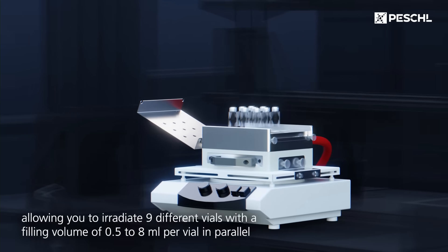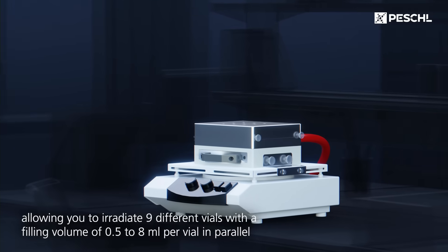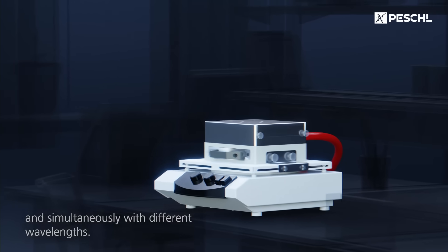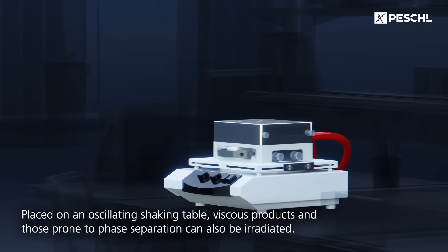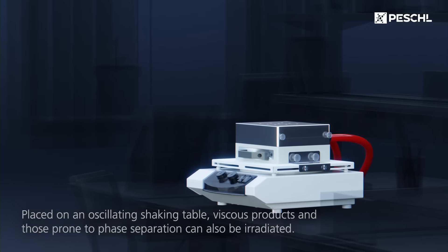Setting up the pre-calibrated photochemical screening device is quick and easy, allowing you to irradiate nine different vials with a filling volume of 0.5 to 8 millilitres per vial in parallel and simultaneously with different wavelengths. Placed on an oscillating shaking table, viscous products and those prone to phase separation can also be irradiated.